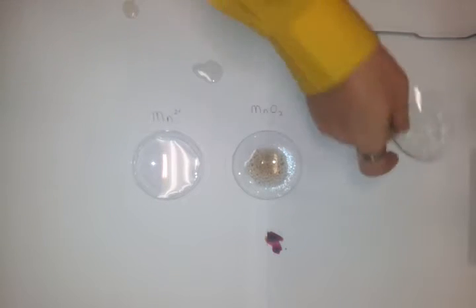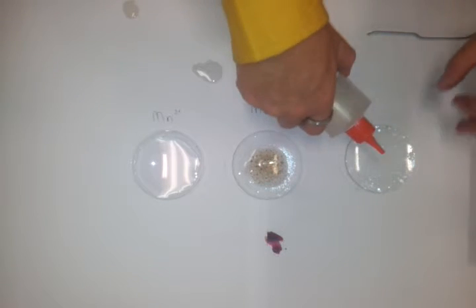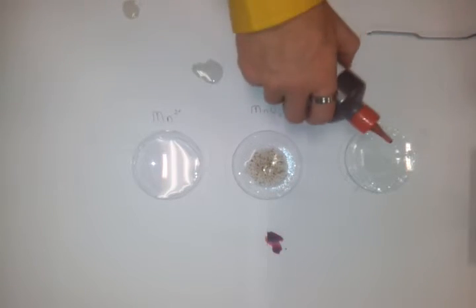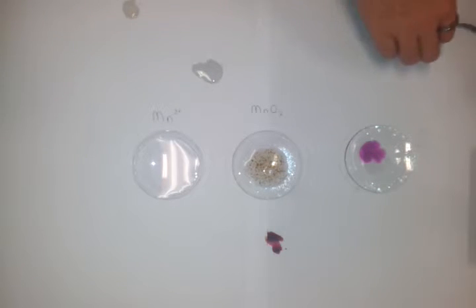So I'm just going to go set that one up again. This one here is a little bit harder to get going because it does need very alkaline conditions. So clearly I didn't put enough sodium hydroxide in this. I'll start with the sodium hydroxide this time and do it quite a lot. And actually, I'll make my permanganate solution alkaline. So we need a couple of drops.